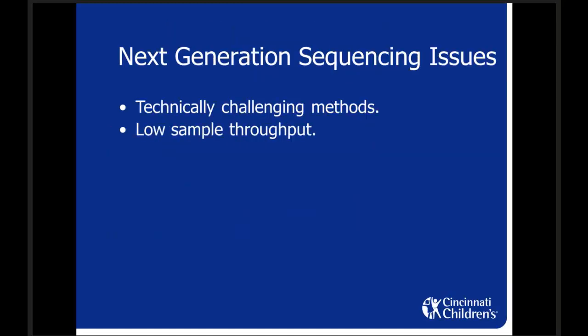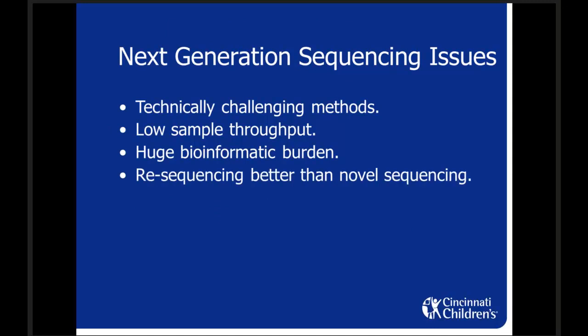Now, there are a number of issues with next generation sequencing. These first four here are going to be more the responsibility of whoever's generating the data for you. But one of the things I would like to point out is that there is a very large bioinformatic burden in these types of experiments. And when you're actually analyzing the data, this can become an issue also.